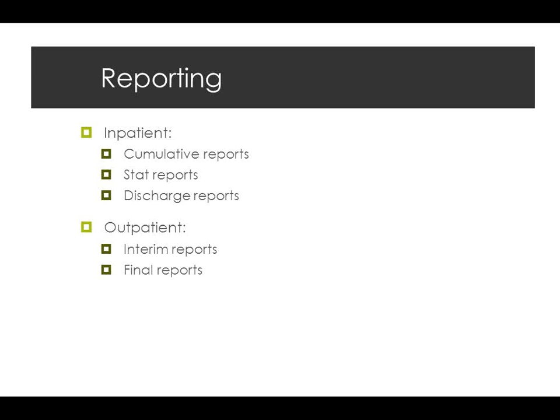Outpatient reports, the concept of interim reports and final reports, because tests come back at different times. You may want to say, well, the CBC and the sodium and the other chemistries, those came out today, but that test I sent to Mayo isn't going to come out till next week. I don't want to hold up the CBC, so I print that as an interim report and say, okay, that thing to Mayo is still pending.